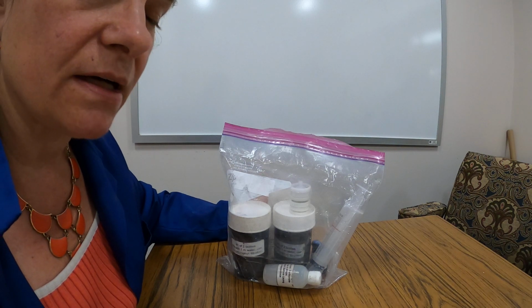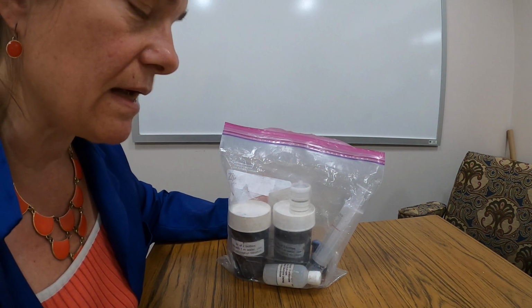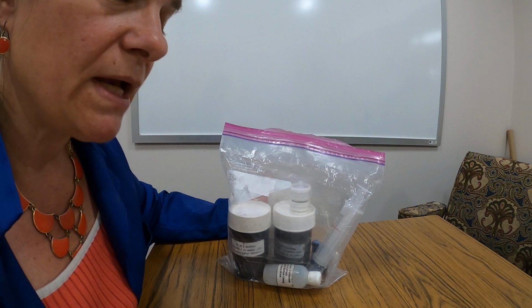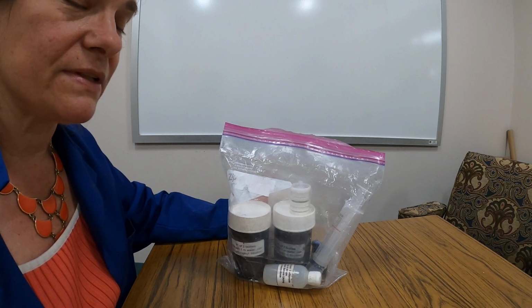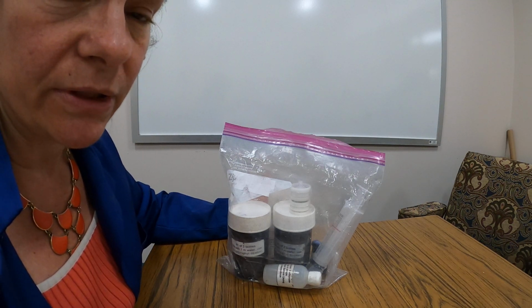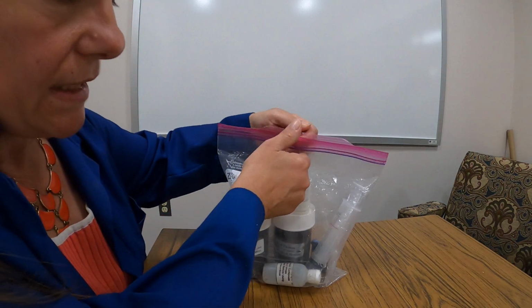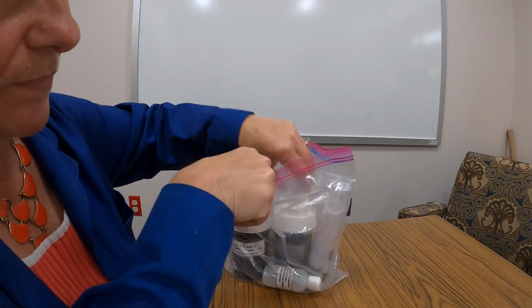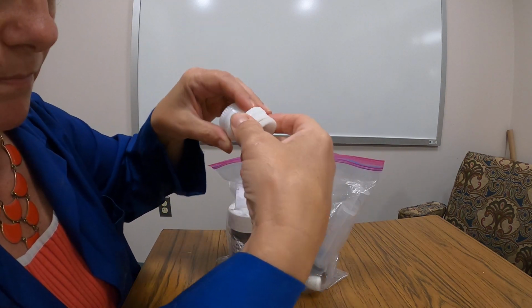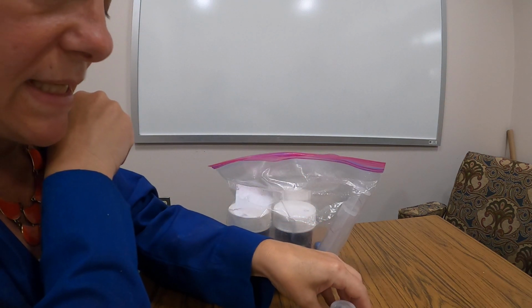This is best done: you collect the sample at your monitoring site and then you bring that sample to shore, and preferably in your car or out of direct sunlight, or maybe even back in your kitchen, you do the rest of the filtration. So your chlorophyll kit will include 2 filter holders, and that's to remind you that we're going to filter each sample twice.